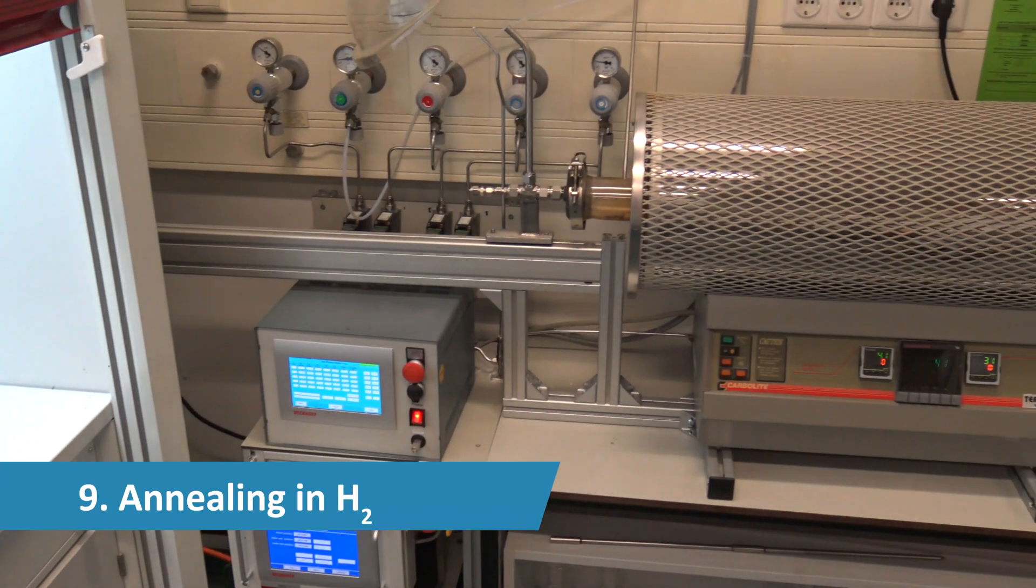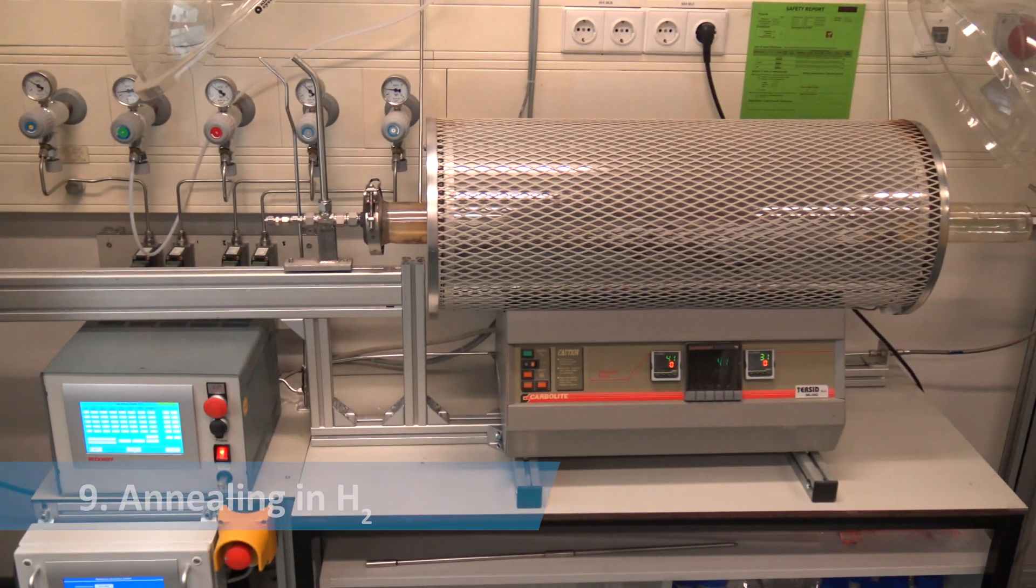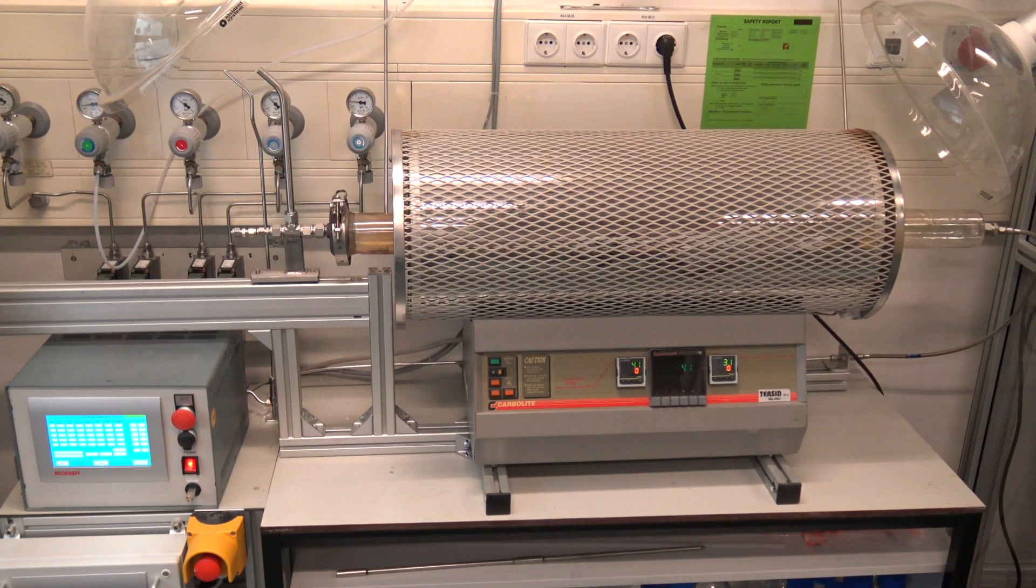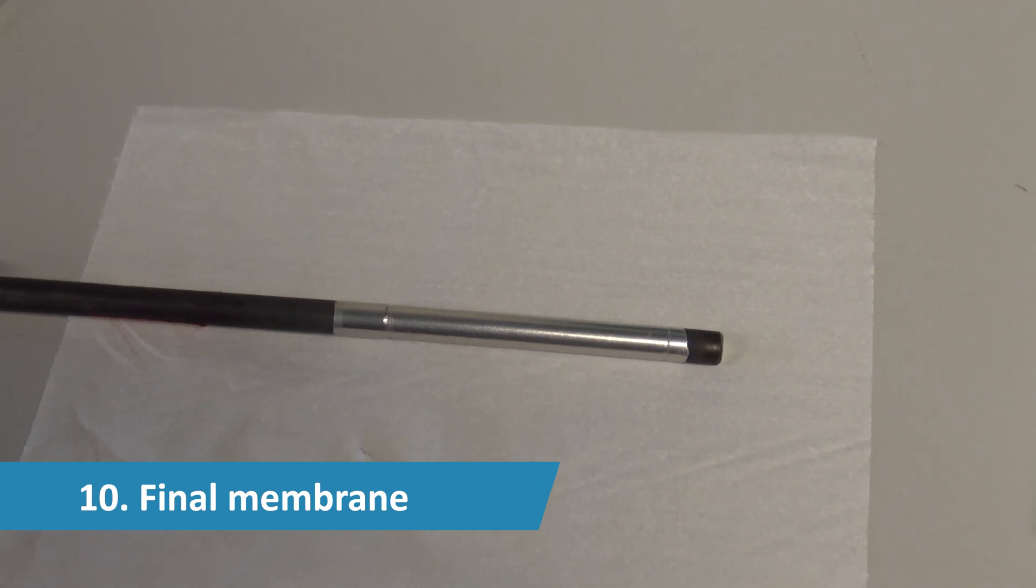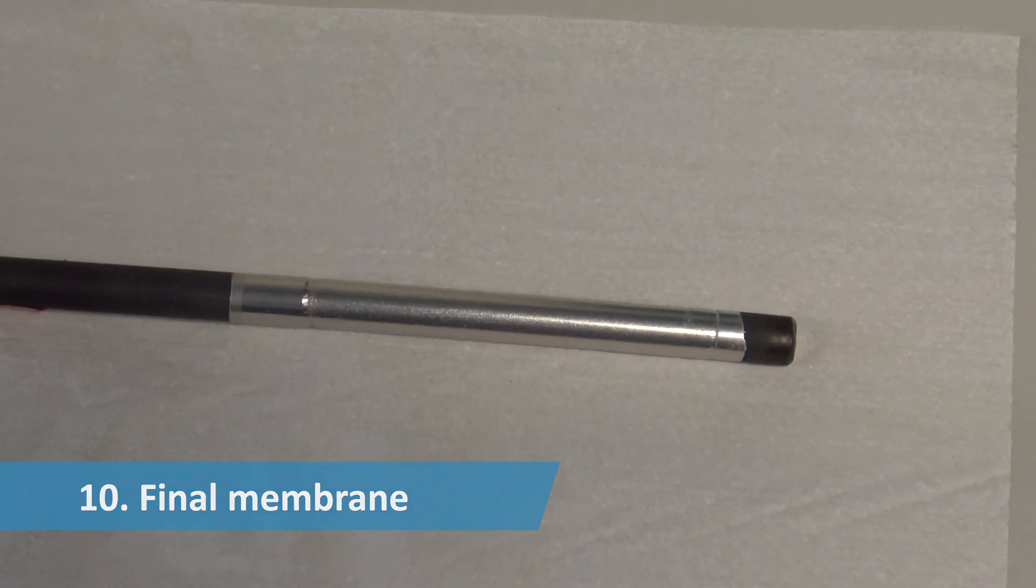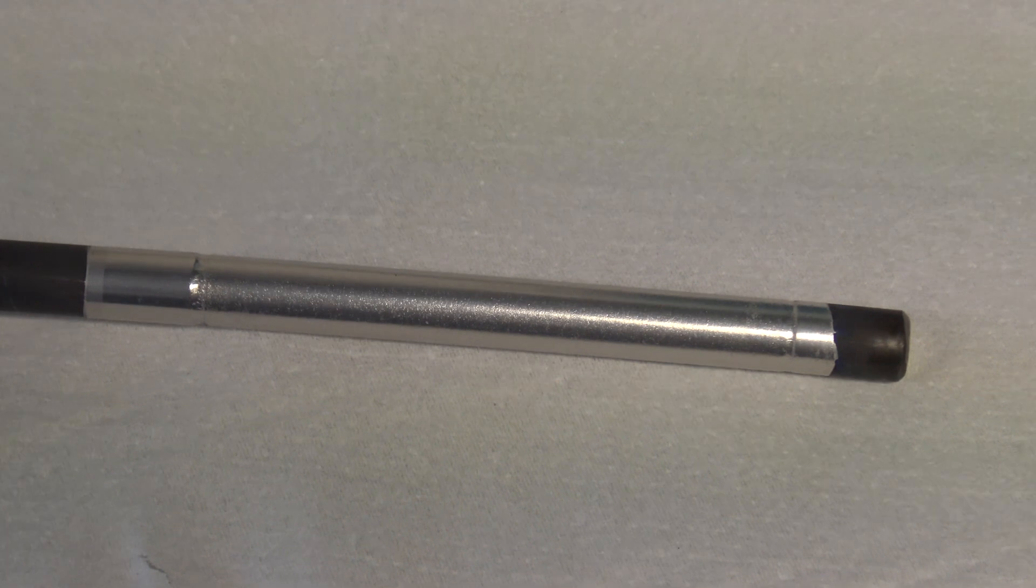Lastly, the membrane is annealed in a hydrogen atmosphere. The final result is a stable palladium silver membrane ready to use in novel reactors or gas separation units.